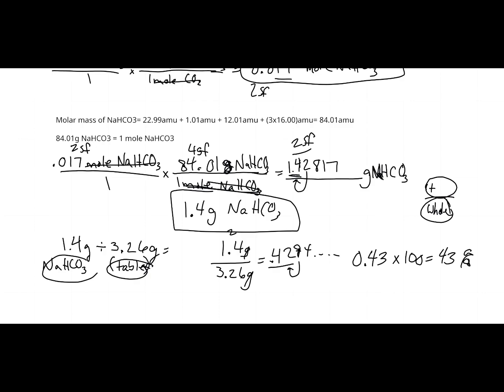And so that's the total amount: 43% of that tablet was sodium bicarbonate. And that is pretty much it. If you have any questions, just go ahead and give me an email or shoot me a text, and I can walk you through that again if you need me to. You will need to have all of these calculations as well as the process and the procedure that we did today. Have a great one.